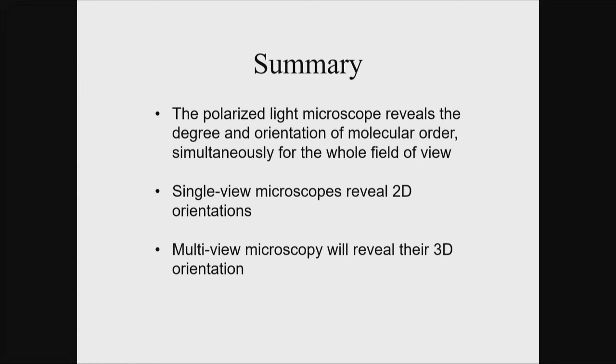In a regular light microscope, you don't have isotropic resolution. You have good resolution in the plane perpendicular to the optic axis. But along the axis, when you focus up and down, for high NA objects you have about a factor of 2 less resolution. And for low NA, for macroscopic type imaging, where you don't have that large a viewing angle over which you collect the light, you have maybe 10 times less resolution.